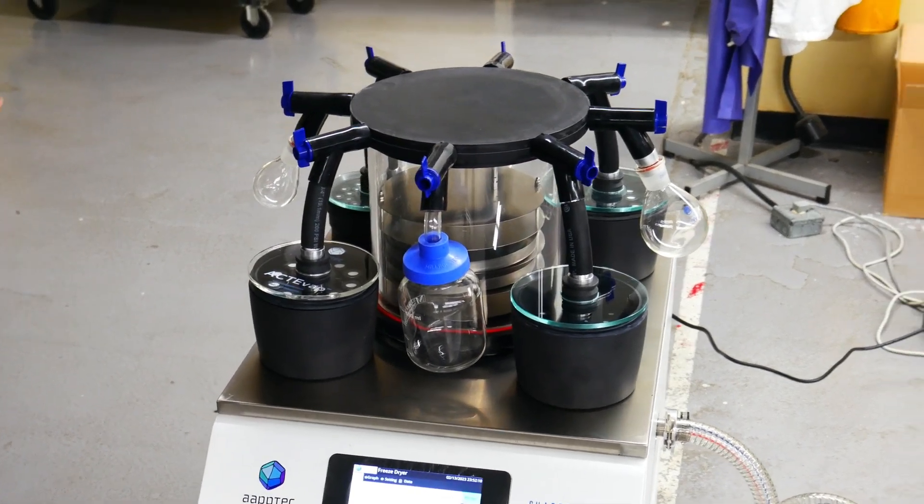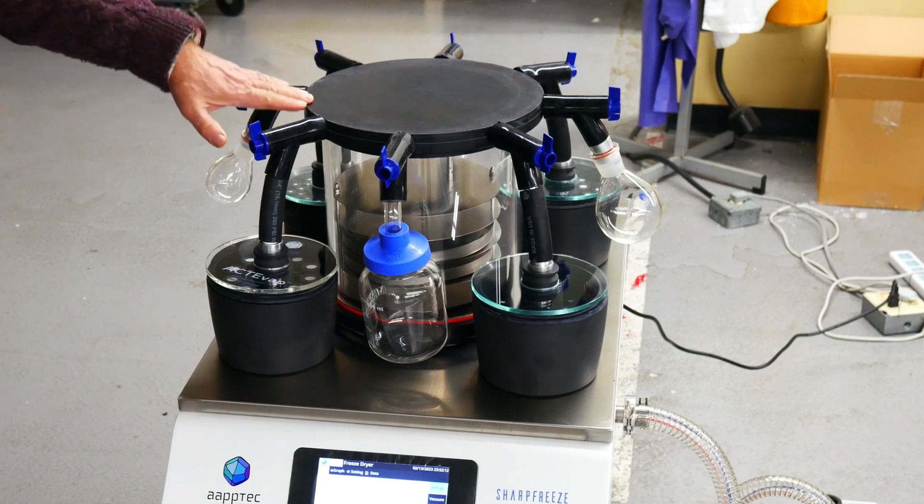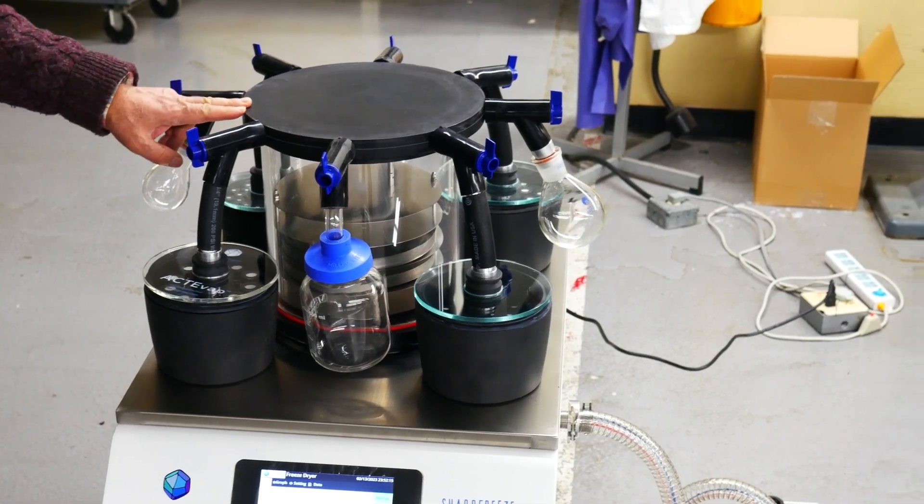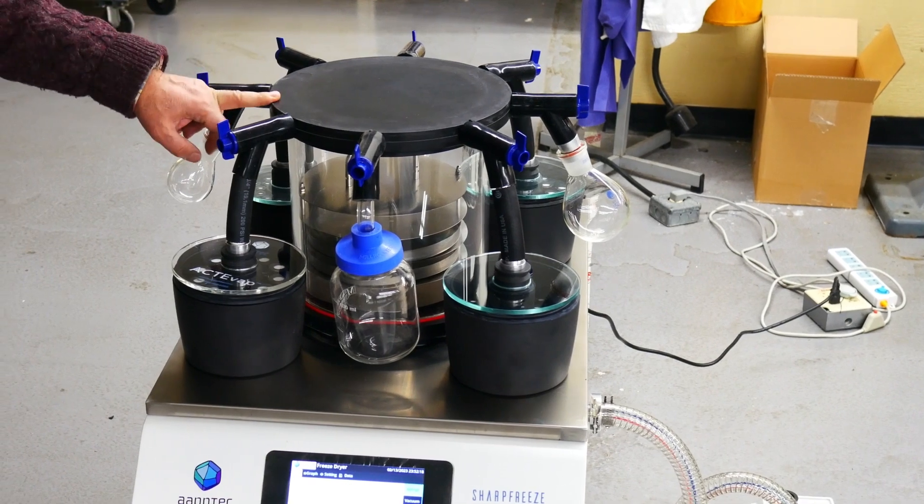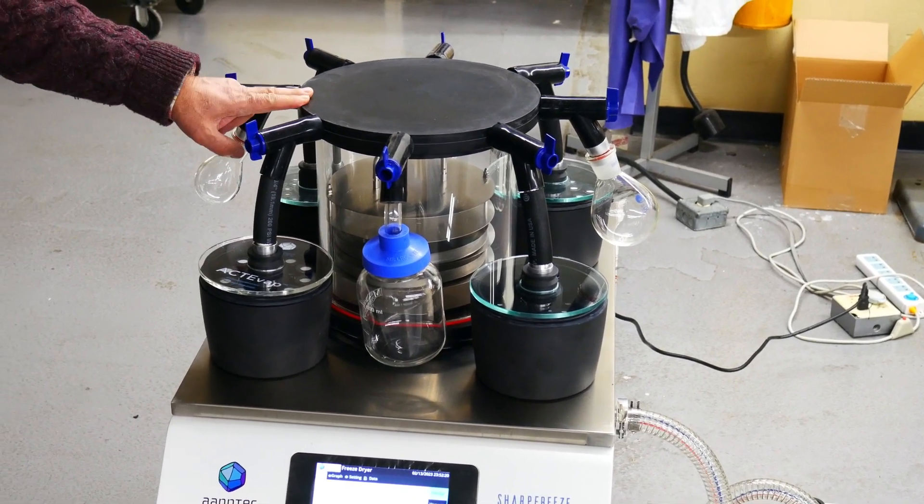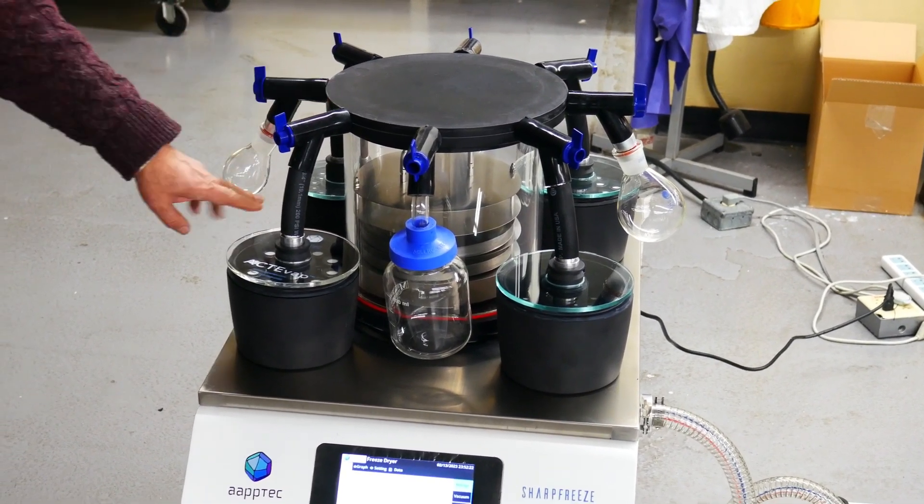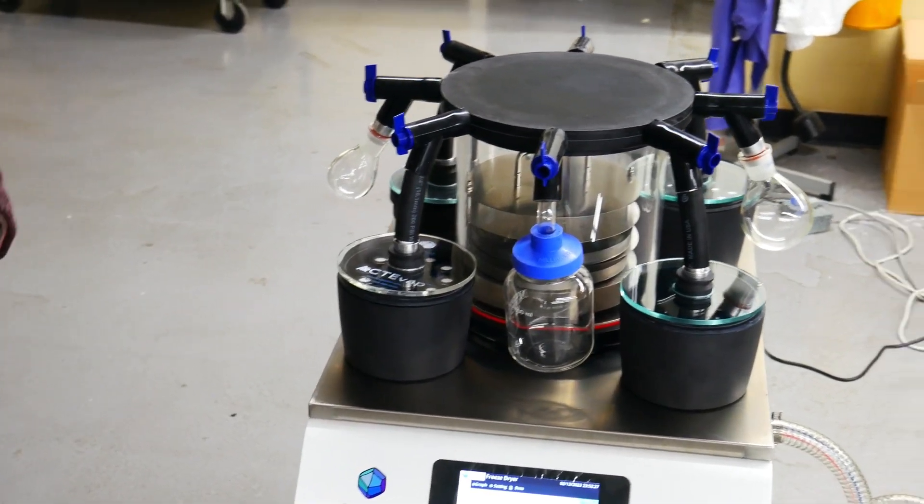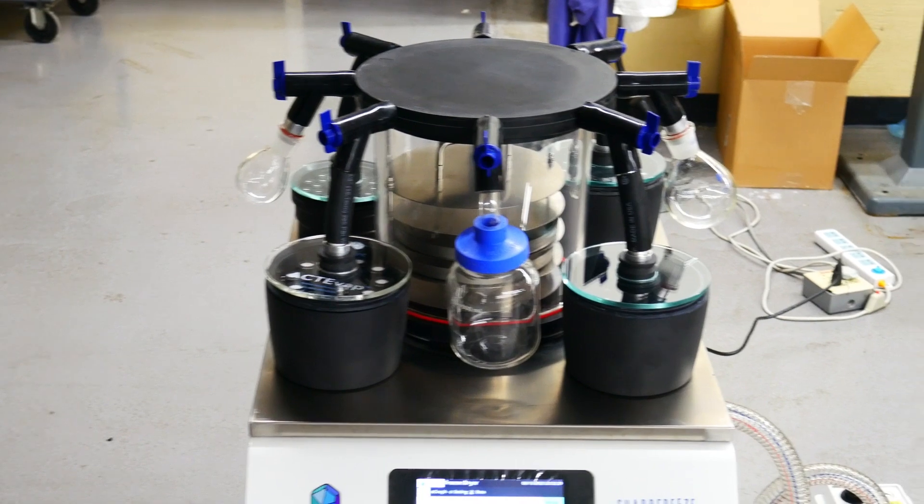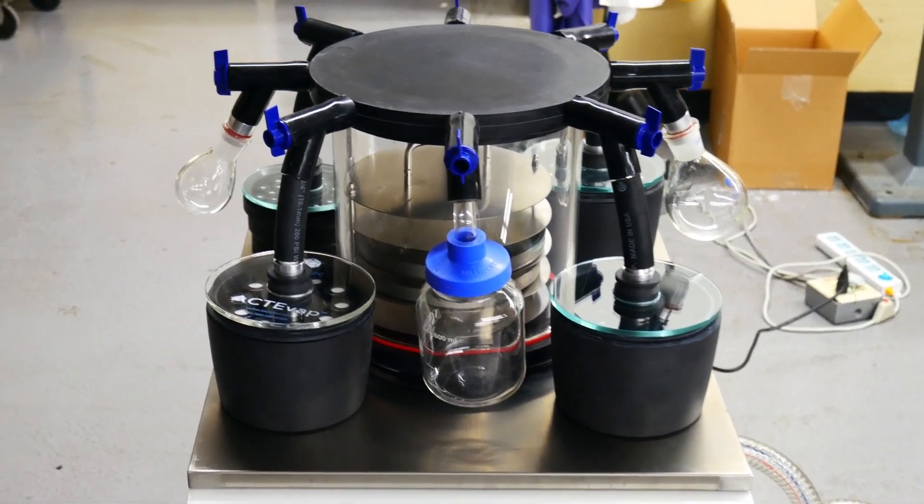The Sharp Freeze is the most flexible freeze dryer in the market. There are two chamber sizes. You can choose 10 inches or 15 inches, and with or without a manifold on top. It also comes with shelves, and the shelf height is determined by whatever the customer needs. A shelf can accommodate a vial or a tray inside the freeze dryer.